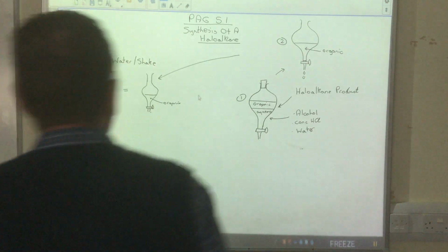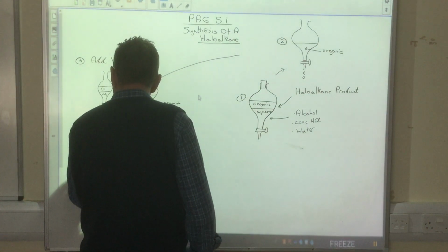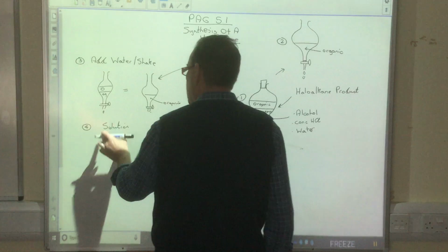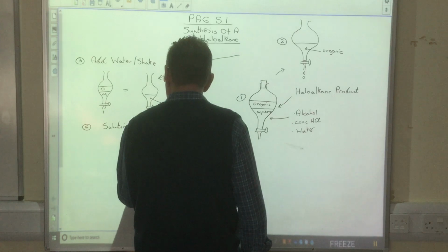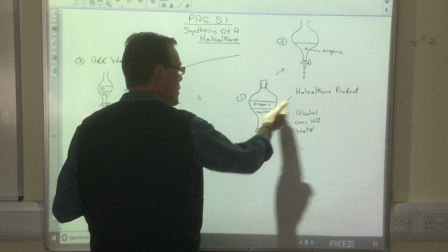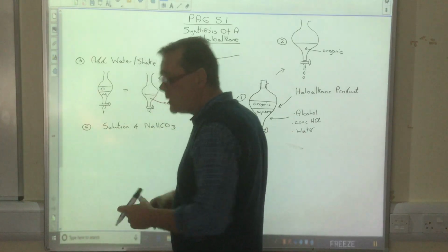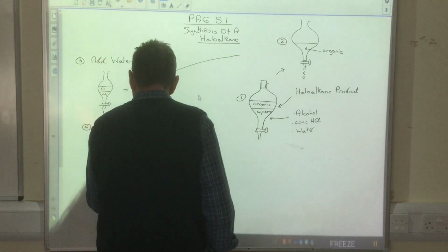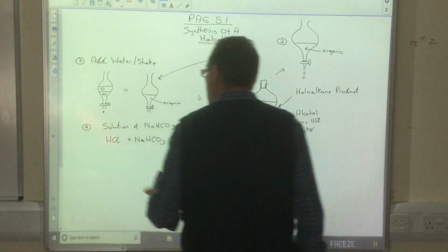Okay. Right then. So you can add a solution, and you can do this at the same time as you add water. Add a solution of sodium hydrogen carbonate or some kind of carbonate. What will that do? Well, if there's any hydrochloric acid left, because there always is, it'll fizz, okay? And your hydrochloric acid will react with your sodium hydrogen carbonate, it will neutralise it.